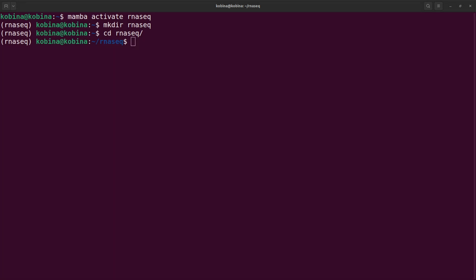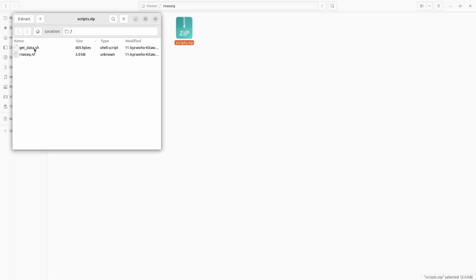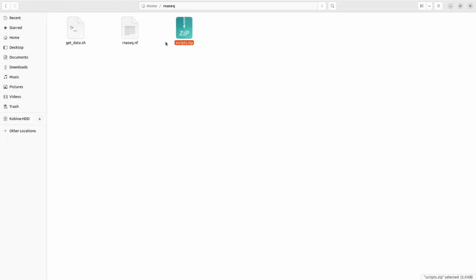If you are watching on Patreon, attached to this video you will find the scripts. You'll find two scripts. You may see them this way, or you may also see them as zip files. If you see them as zip files, just unzip them, open and extract, and then use them. You can also use the command line to extract them. Anyhow, you will have access to these scripts. These are the scripts we need for this exercise.